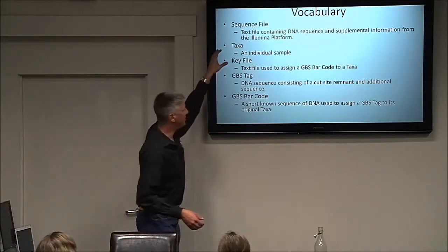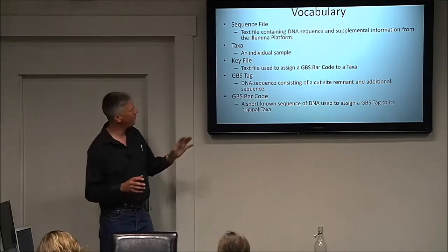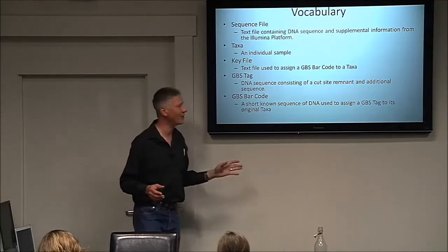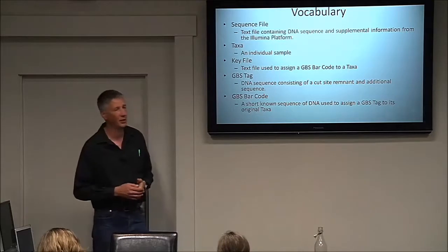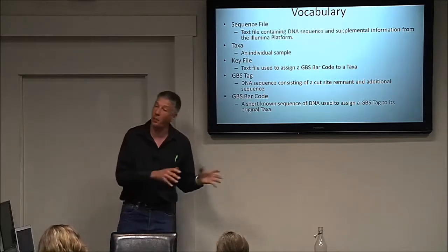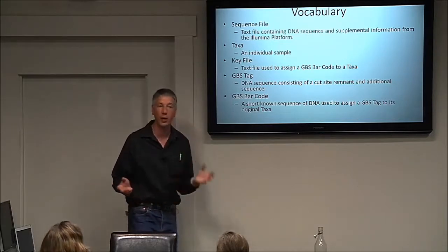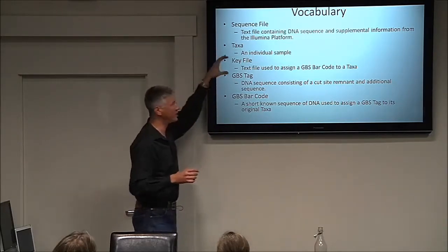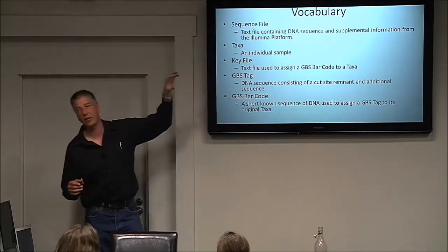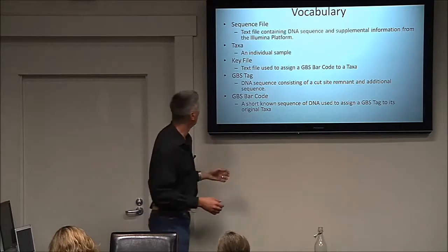A taxa, when we're using Tassel, this software, is an individual sample. We haven't even defined Tassel, really, have we? It's software developed in the Buckler group to do lots and lots of things. The GBS pipeline is one subset of those things and does a lot of genetic analyses. And we'll play with it tomorrow. But in that world, a taxa is an individual sample. So sample and taxa are interchangeable in this context.